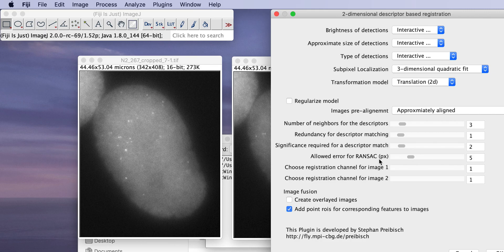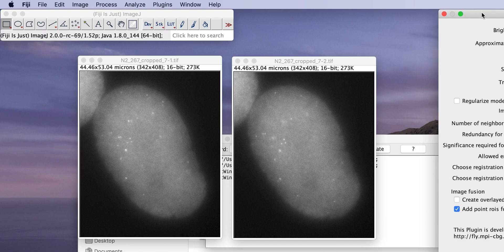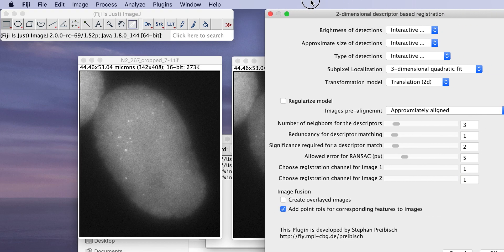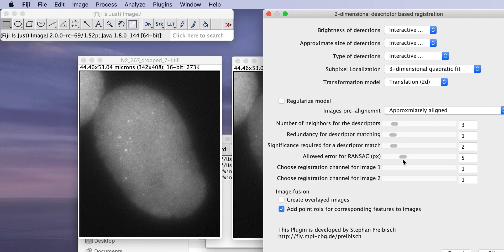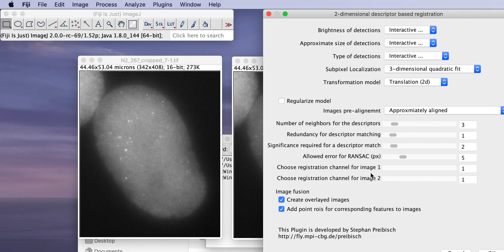The allowed error for RANSAC is, as I said, we do outlier filtering. That means it finds corresponding points and it will visualize these corresponding points later. And it matches them relatively together. There's still a remaining error, no matter which transformation you want to use. And this defines how big this remaining error is allowed to be. Five is a reasonable alignment. If you're not sure, you might want to have it one pixel, you might want to have it 50. It really depends on image. So five is usually a reasonable parameter. So we want to create overlaid images and we want to add point ROIs where it actually shows us the features that were found. So that's it. We press OK.